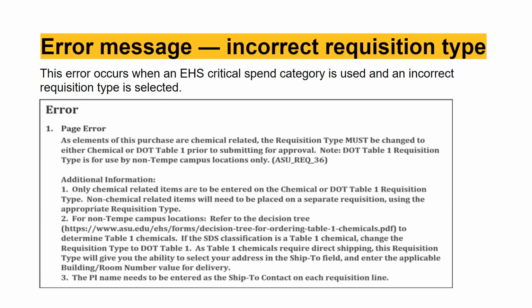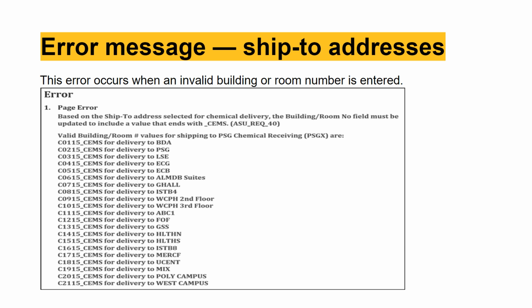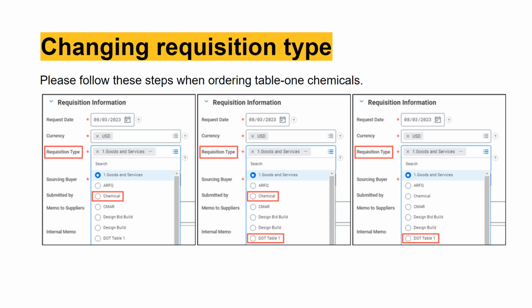The next several slides are examples of common error messages received. Please follow these steps when ordering Table 1 chemicals.